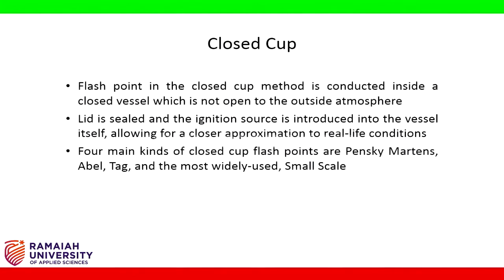Closed cup. Flash point in the closed cup method is conducted inside a closed vessel which is not open to the outside atmosphere. The lid is sealed and the ignition source is introduced into the vessel itself, allowing for a closer approximation to real-life conditions. Four main kinds of closed cup flash points are Pensky-Martens, Abel, TAG, and the most widely used, Small Scale.